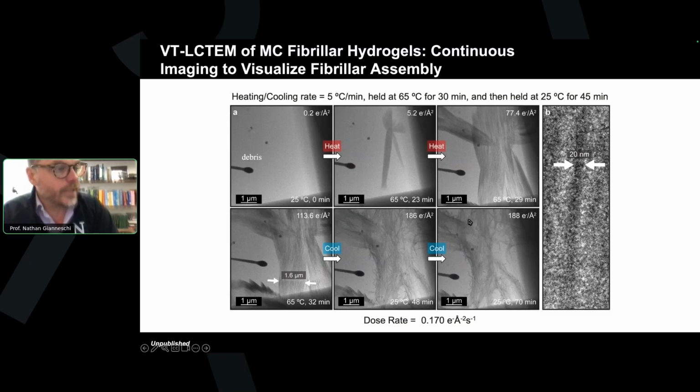but it's provocative to think that we might actually be seeing now the unwinding of those fibrils as we break up and disperse the material. Because of confinement and the timing, that may not be the case, but it's kind of interesting to think we might be able to see this reversible process in a future case, especially where we could cool the liquid cell completely below room temperature, which we can't do currently with our system.